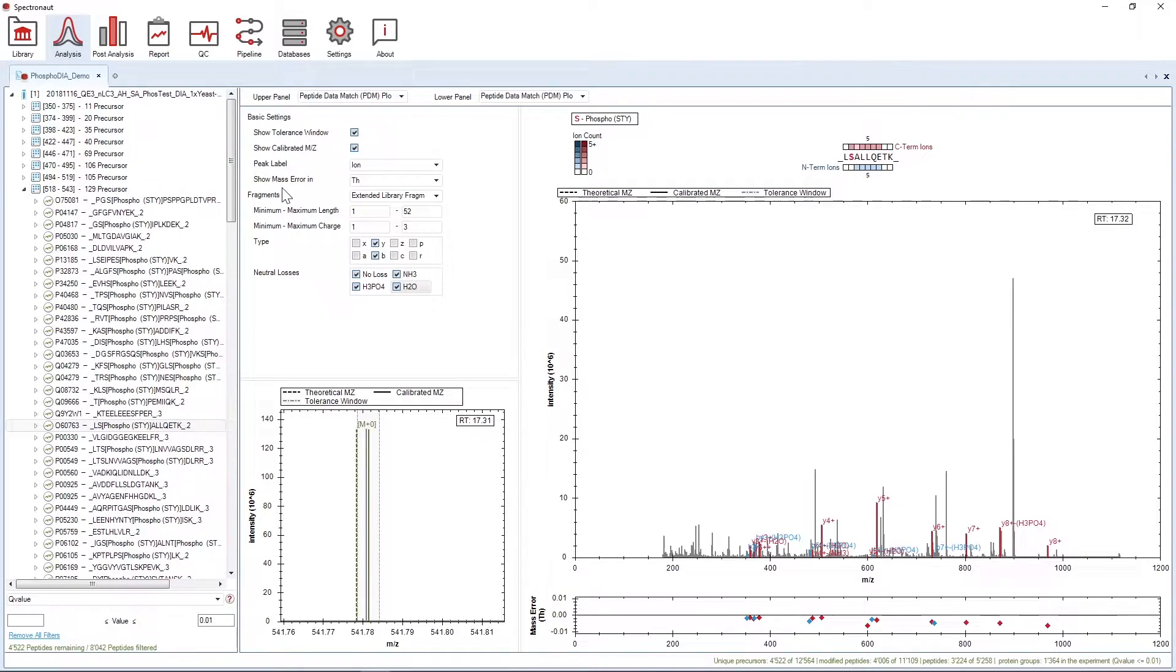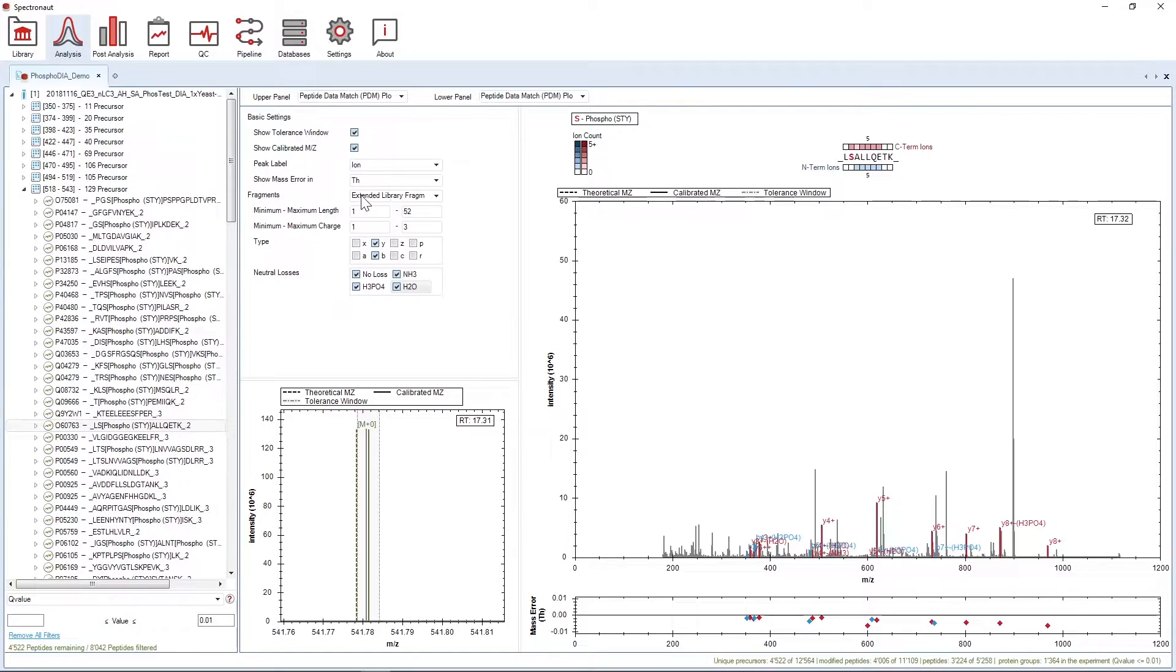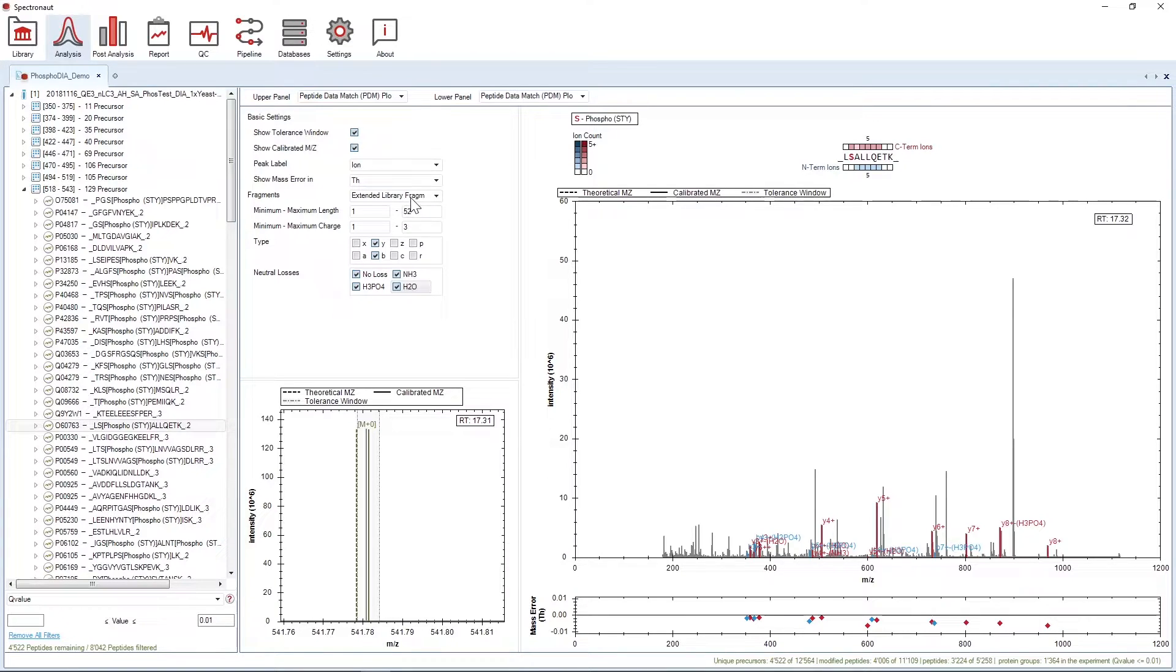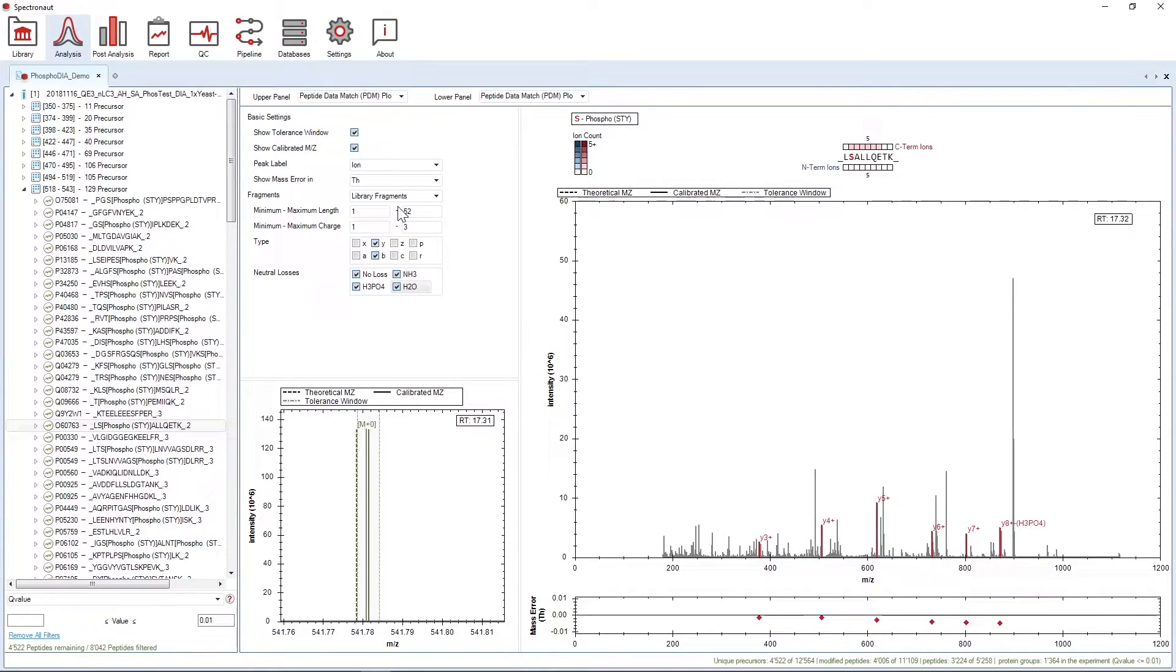Then the fragment filters let you specify which fragments to show on the scan. The default is Extended Library Fragments, which means that all fragments in the library are displayed, independent of whether they were excluded from the assay or not. By selecting Library Fragments, only the fragments that were part of the assay will be shown.